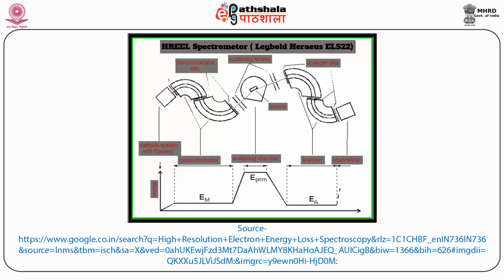For this analyzing CHA, the same facts are valid as for the monochromator, except that in the high resolution lens system that we are using, the beam has also been broadened. To sustain a high enough electron flux to the analyzer, the apertures are also about a factor of 2 bigger.